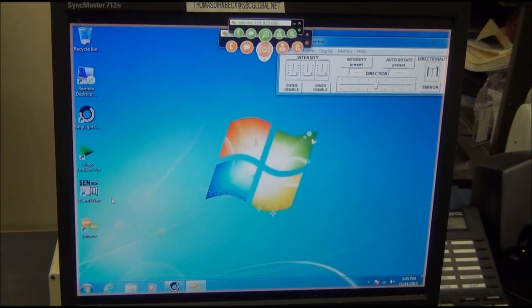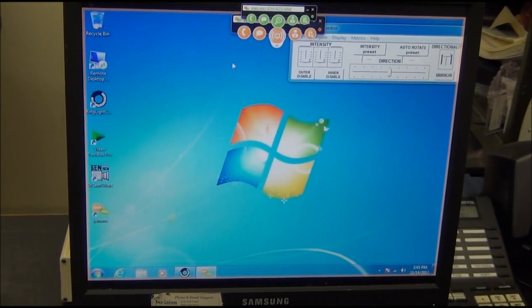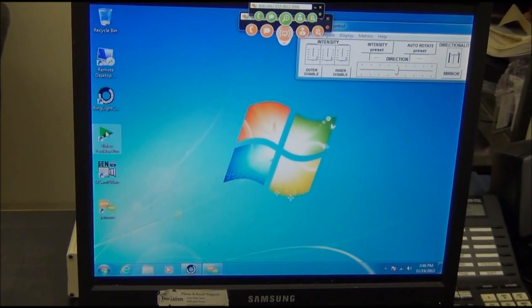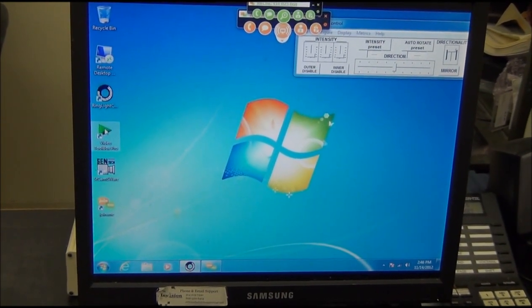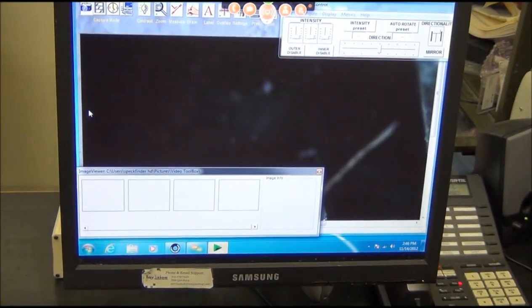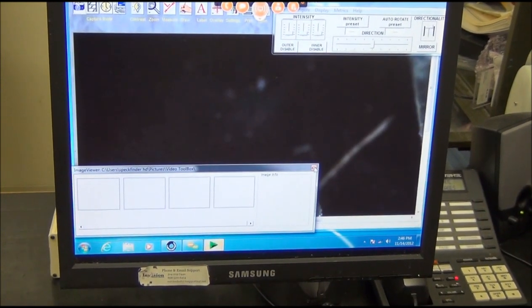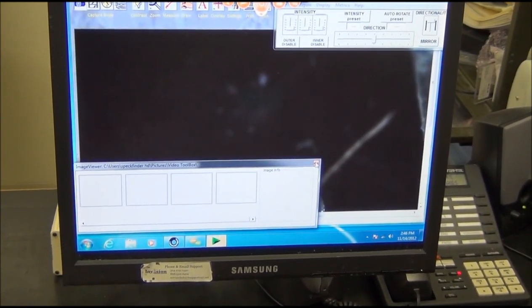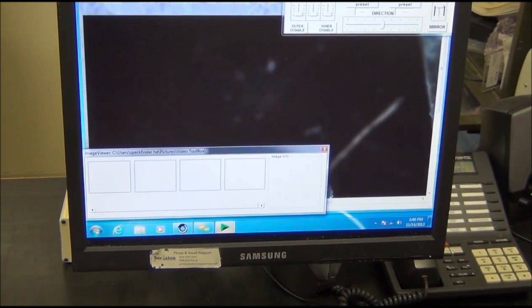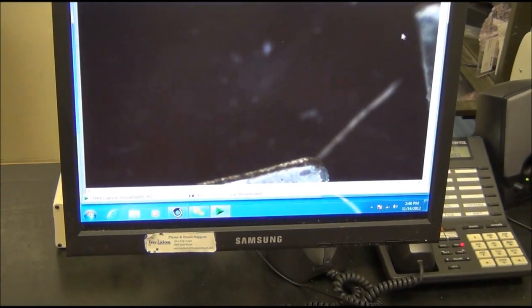Okay, so now we're back at Ann's computer, and from the speckFINDER, we gave her control. We allowed her to have user access. So now she has control over the laptop. Go ahead and click on that video toolbox. Double click on that. Now that application, which is at the speckFINDER site, will open. So what she's doing right now is opening the speckFINDER. Go ahead and close out the speckFINDER viewer. You'll see that there is a delay in the way this works, and the reason is that you are viewing a live image.